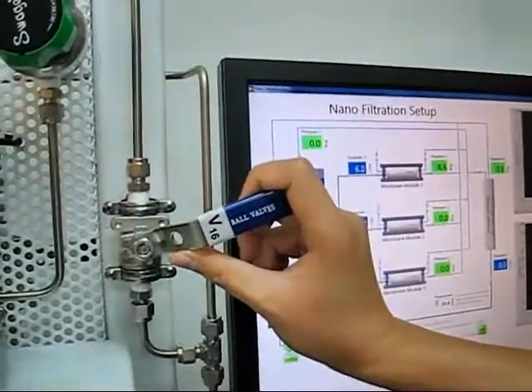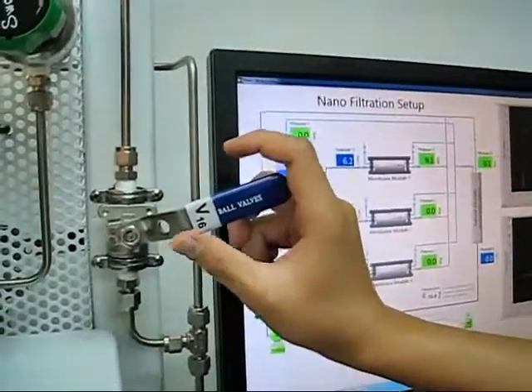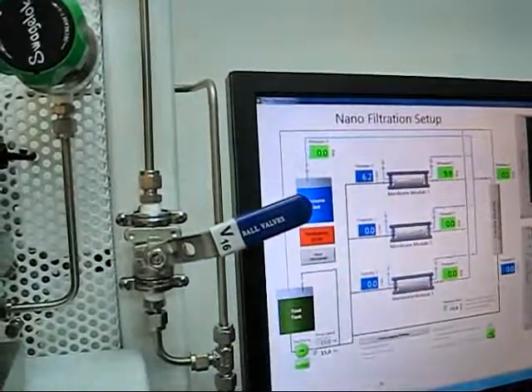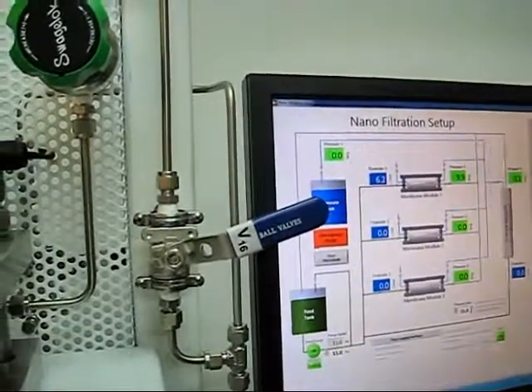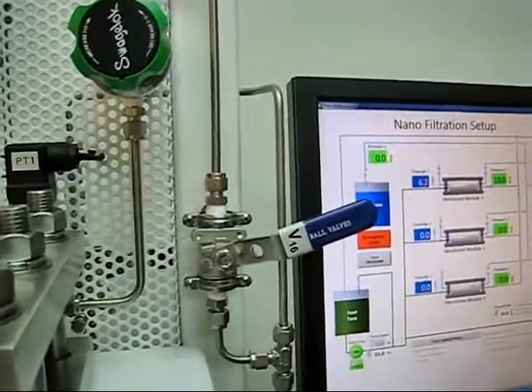As you turn it on, it will take about half a minute or one minute to get to somewhere close to about 9.5 — yes, 9.6. Sometimes you can just achieve 10 bar or 9.9 bar using just V16 itself.